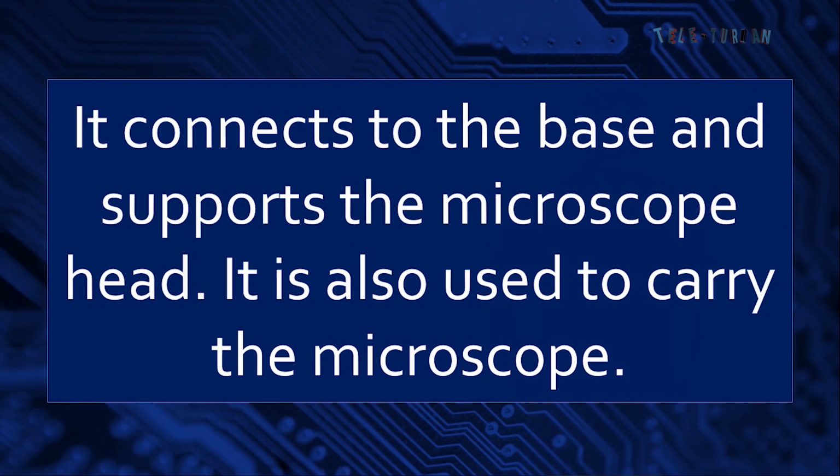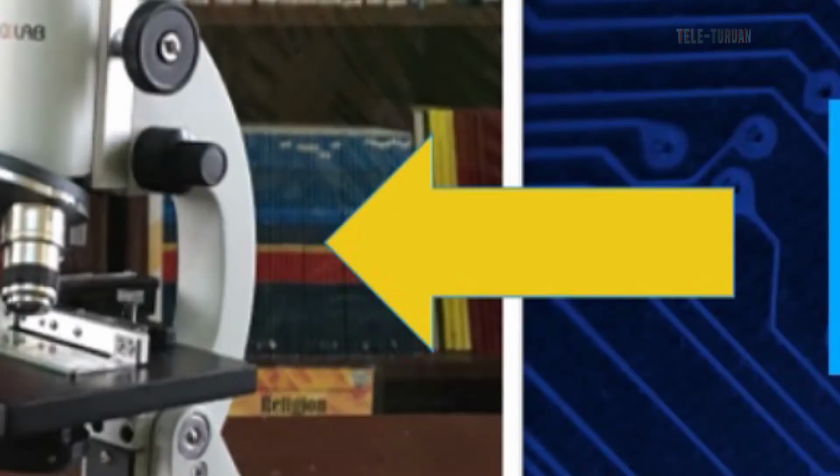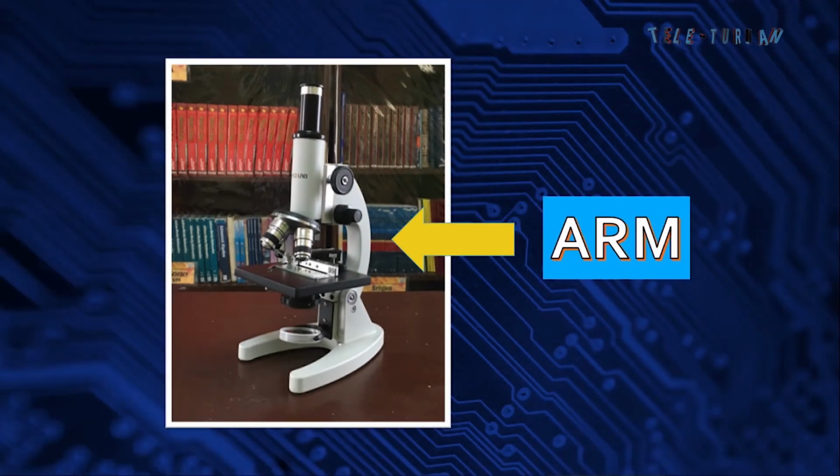How about this one? It connects to the base and supports the microscope head. It's also used to carry the microscope. You got it, it is the arm.